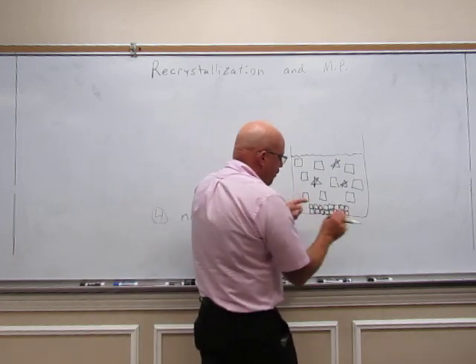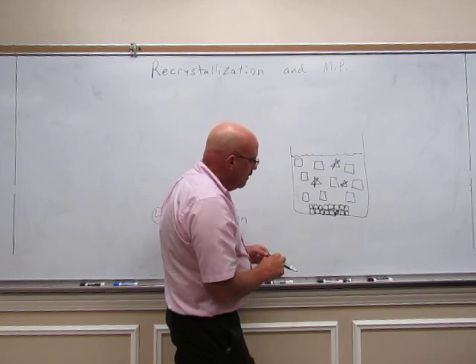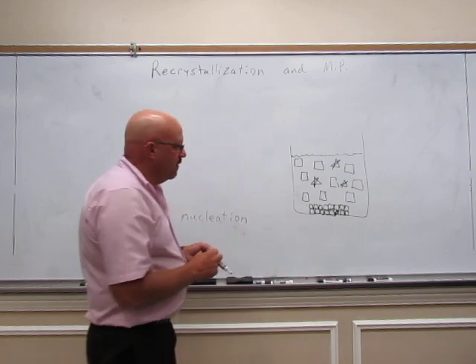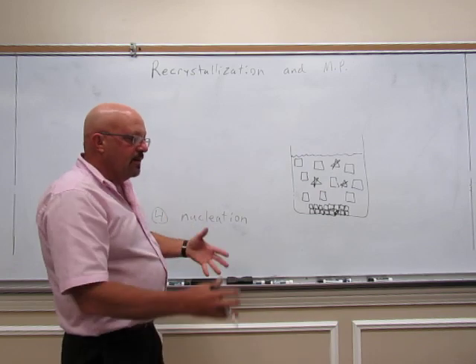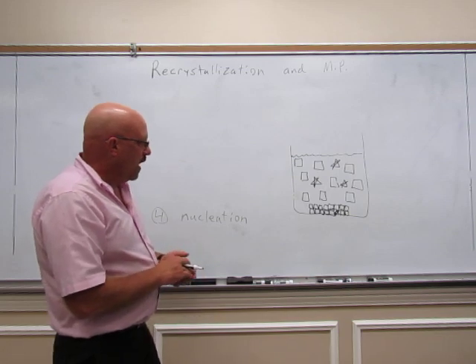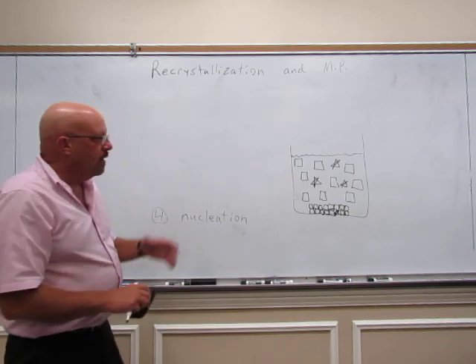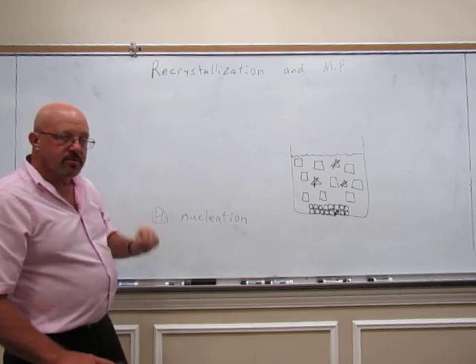Crystals, you know what a crystal looks like. It's nice and shiny, and you know what a crystalline material is. They usually have a real shiny surface and everything's fit in there. Precipitant is just like a powder. We just get a powder out. So if it cools too quickly, you get precipitation. Cool it nice and slow, and that gives the crystals time to grow.